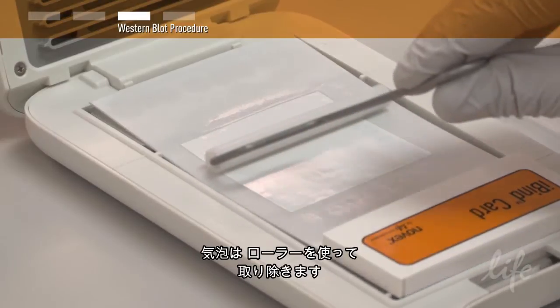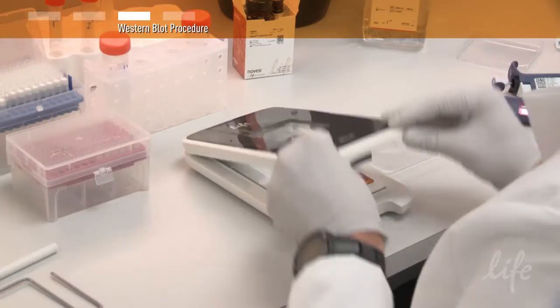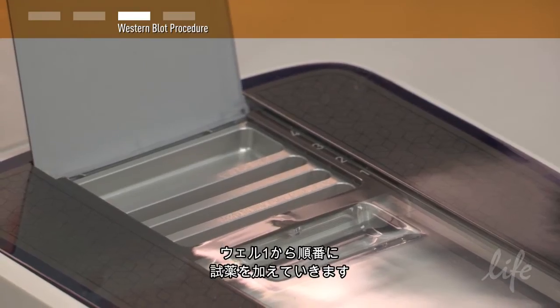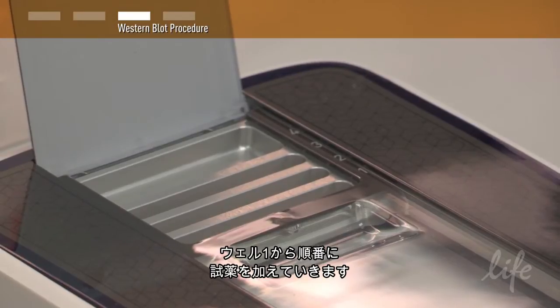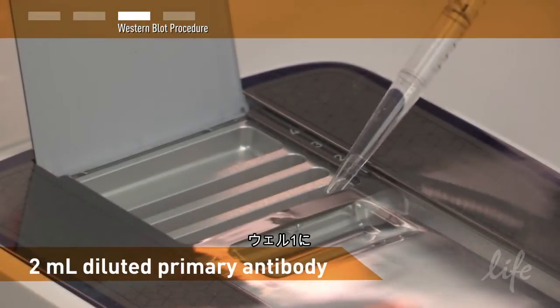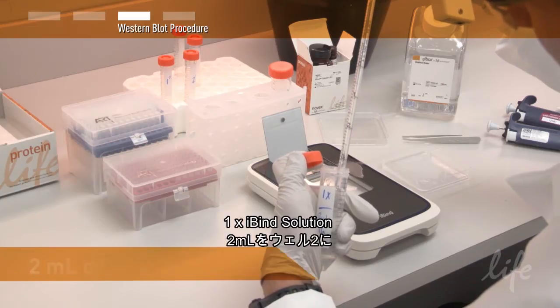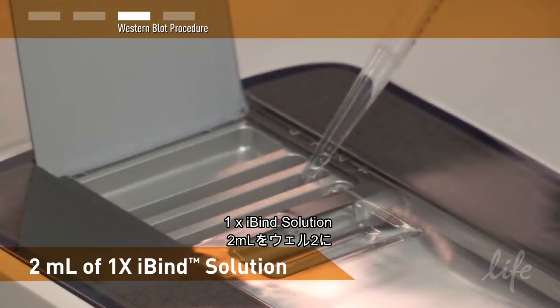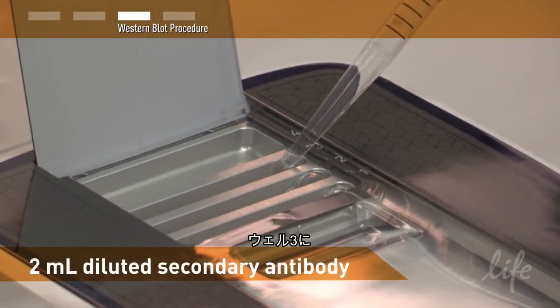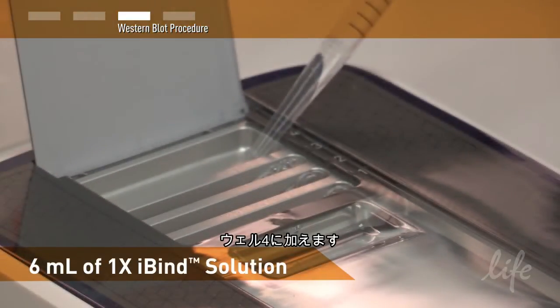Use the roller to remove any air bubbles. Before closing, make sure to push the card up against the stoppers on the hinge. Close the iBind device and open the lid exposing the wells. Add solutions sequentially to the iBind wells, starting with well number 1. Load 2 milliliters of the diluted primary antibody into well 1, then load 2 milliliters of the 1X iBind solution into well 2, next load 2 milliliters of the diluted secondary antibody into well 3, and finally load 6 milliliters of the 1X iBind solution into well 4.